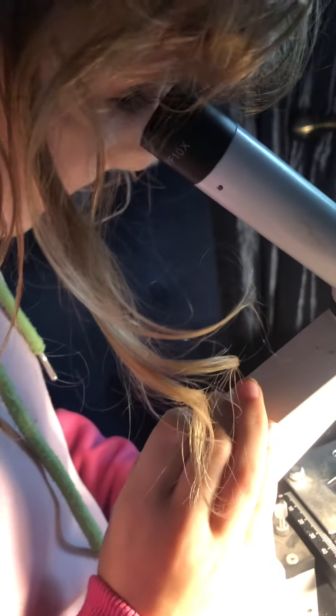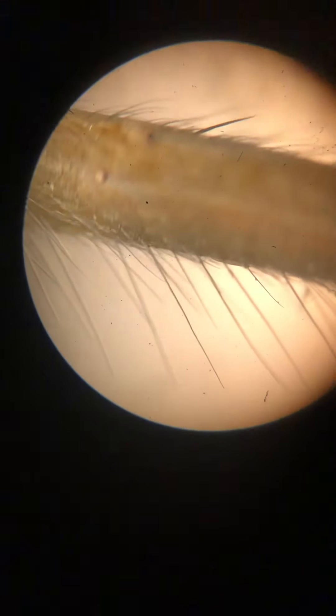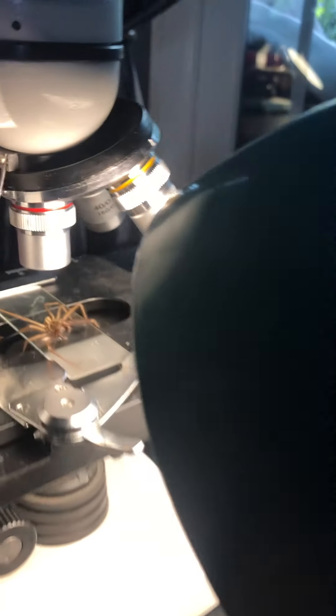Oh, is that a leg? Yeah, this is a leg. Let's have a look. Wow. Yeah, that's a big spider's leg.